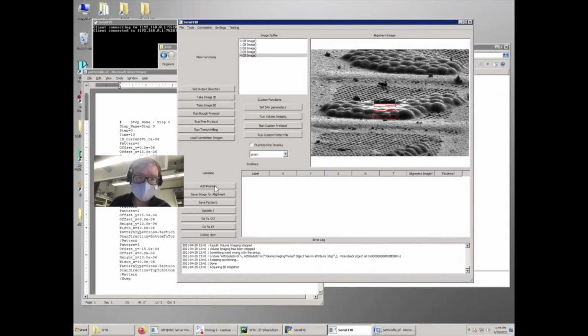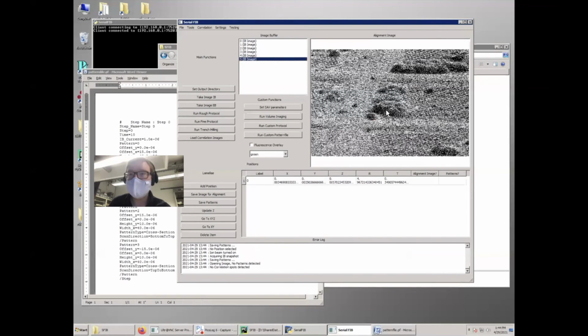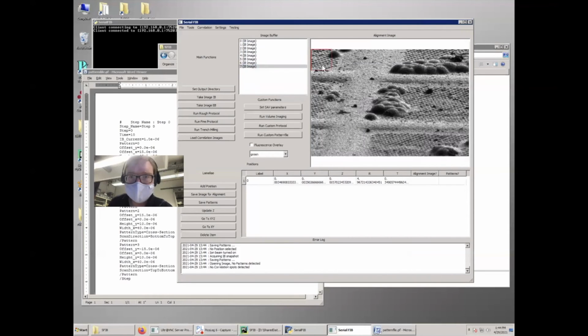We just save this position, we delete this position because we don't need it anymore. We take another image in the ion beam. We don't see much, maybe for visual reasons, we just take one where we see a little more. This is just because of the 1.5 picoamps that we're using currently due to our bad apertures. Let me just put the contrast brightness again. Yeah. And then you can just draw the same logic, right?